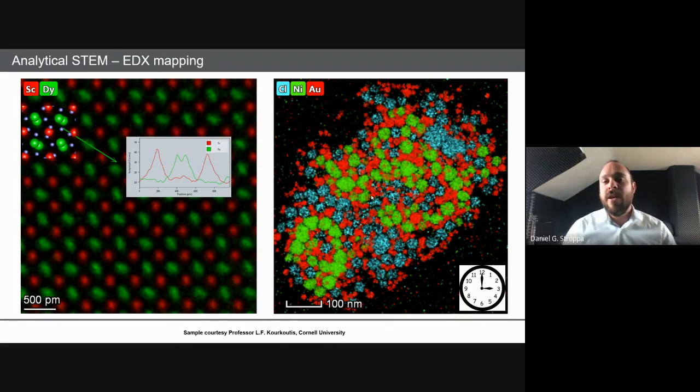So if I want to count the number of vacancies, there will still be noise in the phase that you can retrieve experimentally, so you cannot count single vacancies. This is as far as I know today. But there are some approaches with which you can count atoms, tomography reconstruction methods, or intensity analysis on images. So there are some interesting ways that you can count and reconstruct 3D shapes with atomic resolution, but the direct visualization of single vacancies is not realized at this moment. At least as far as I know. Maybe as we speak, someone is making it happen.